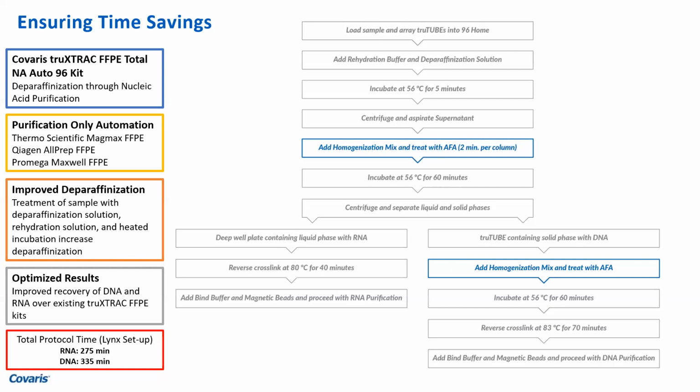You separate that, RNA is on the left side, and you go through incubation, do add the binding buffer and all those things, you get pure RNA. To the right is the DNA, which is a pellet. And of course, when it comes to pellet, you have to first do what? You have to reconstitute it in the buffer. And then from there on, you follow a similar protocol and you get your DNA.